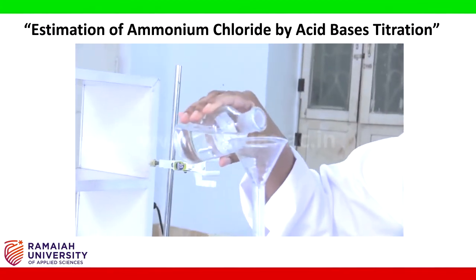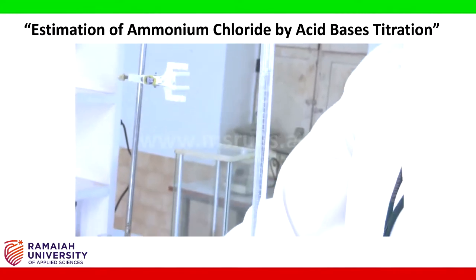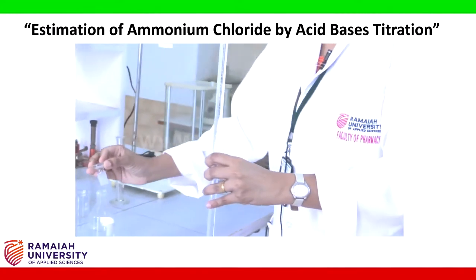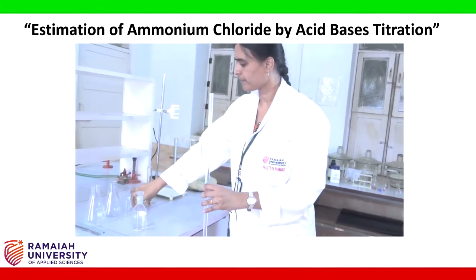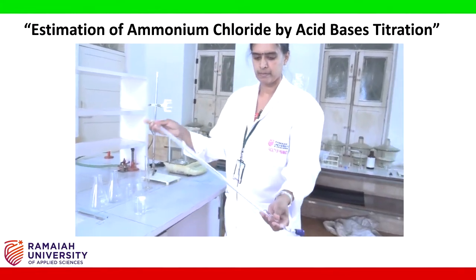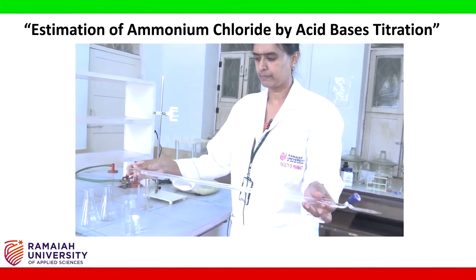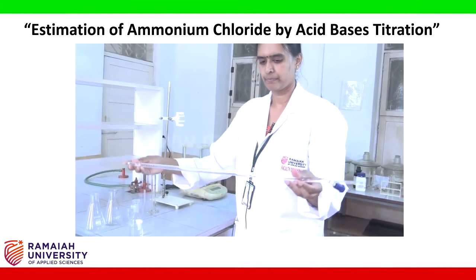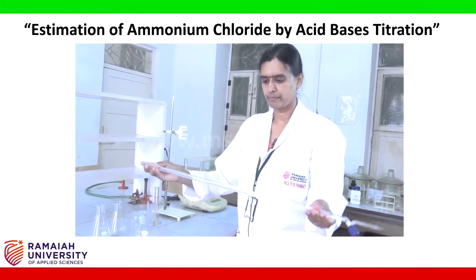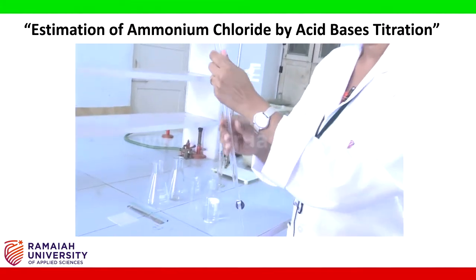Add a few ml of the titrant to rinse the burette. Discard the solution.